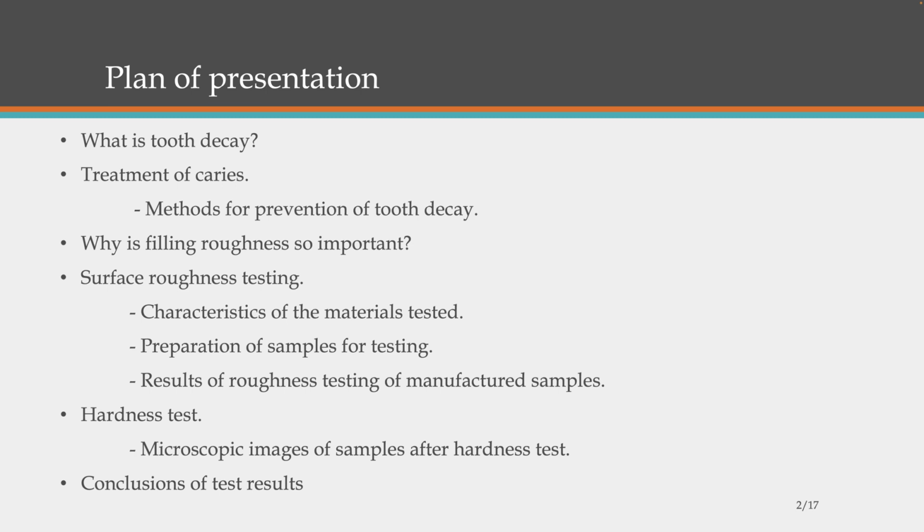Why is filling roughness so important? Surface roughness testing. Characteristics of the materials tested. Preparation of samples for testing. Results of roughness testing of manufactured samples. Hardness test. Microscopic images of samples after hardness test. Conclusions of test results.